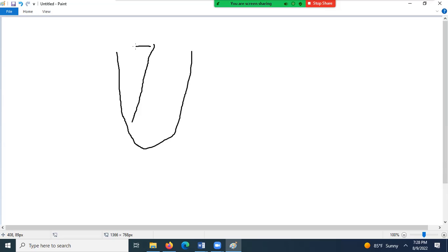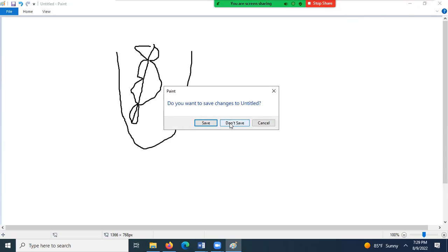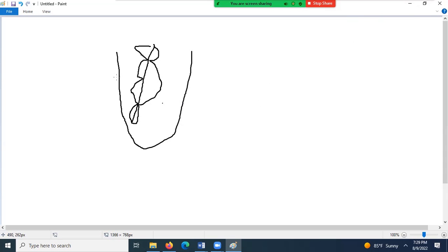But if it flares out from the stab, and usually it flares something like this, if it grows away from the stab, that is slightly motile. Any question about any of that? If it's totally motile, the bacteria will be swimming everywhere, and then it'll be cloudy throughout the tube.